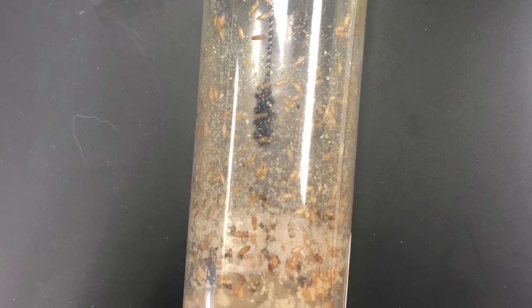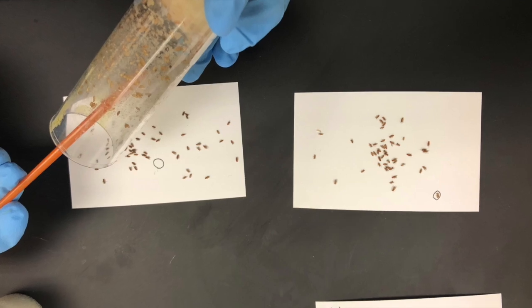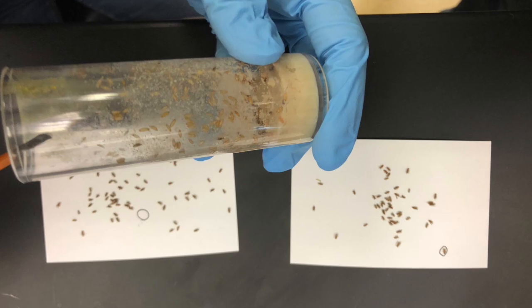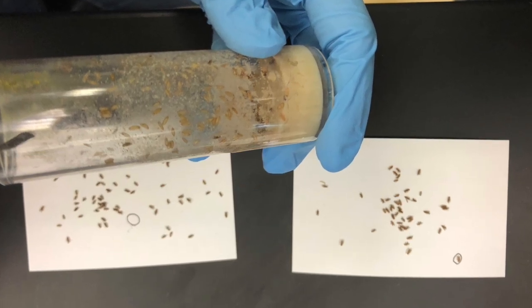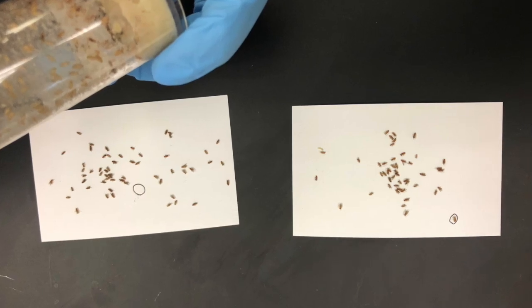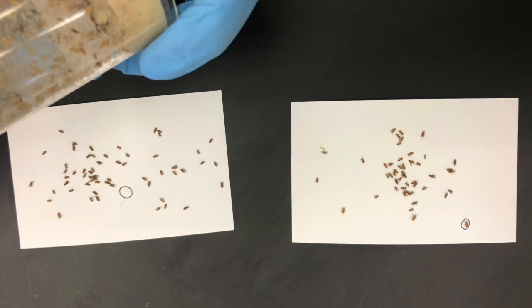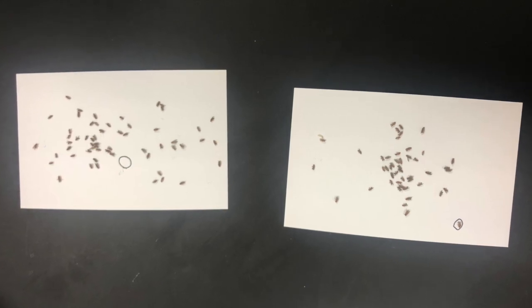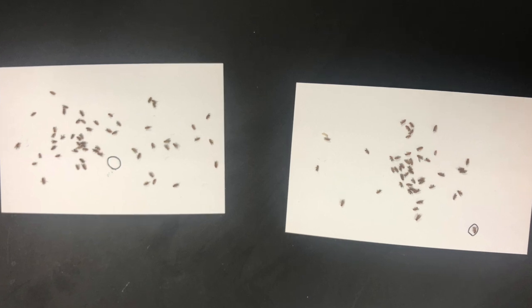After the 7 days, fly nap was used once again to put to sleep the restless flies within the test tube. After 5 minutes and the flies were asleep, the test tube was gently tapped on the outside to loosen the flies. To get them out of the tube, a small paintbrush was used again to get them onto fresh index cards.